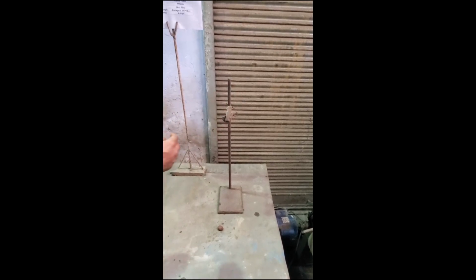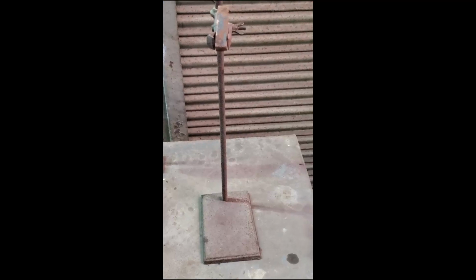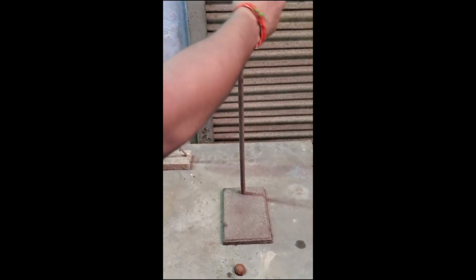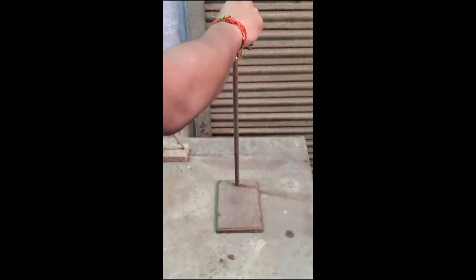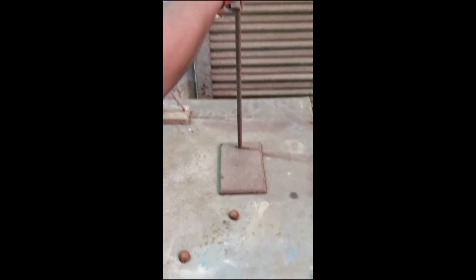So it is not having binder. That's why, you can see, in a single drop it is breaking. But our aim is that it should not break. It has to sustain a number of drops. But within one drop it is totally breaking. This is the third one. Again you can see it is breaking. You can see the small cracks here. Because it is not having any binder, 0% binder, only iron ore powder and water. Same thing.